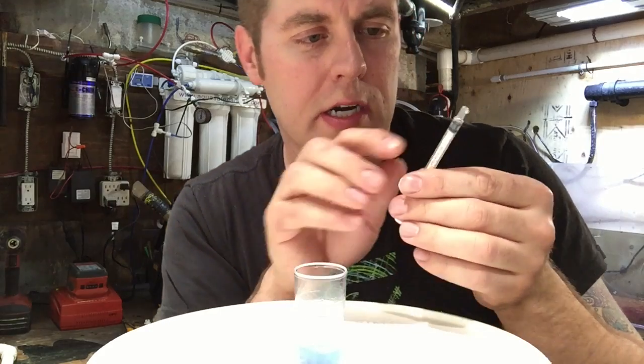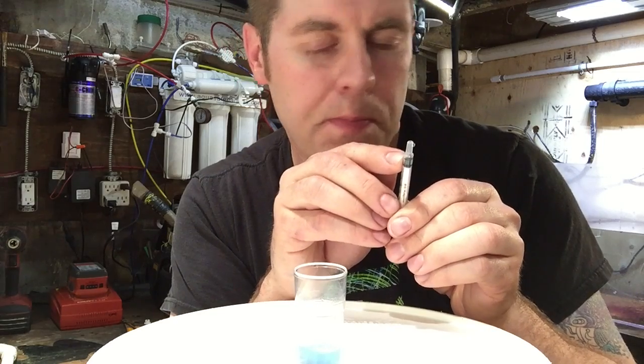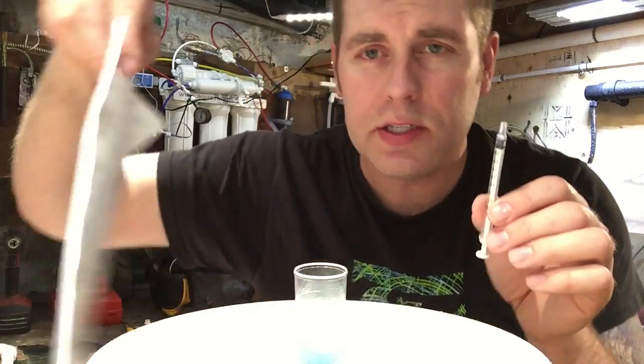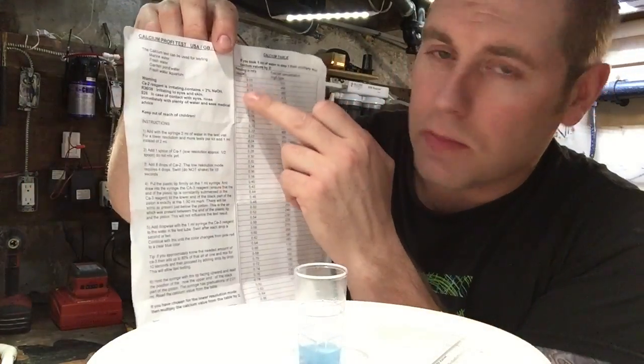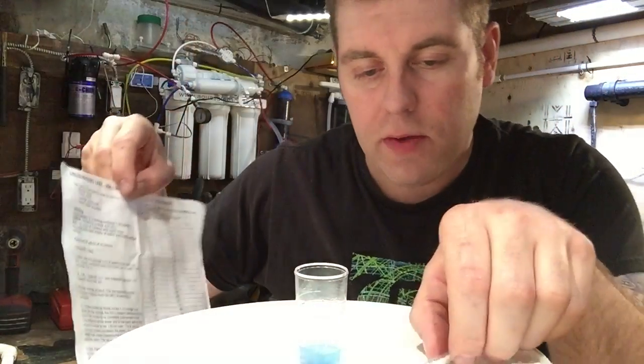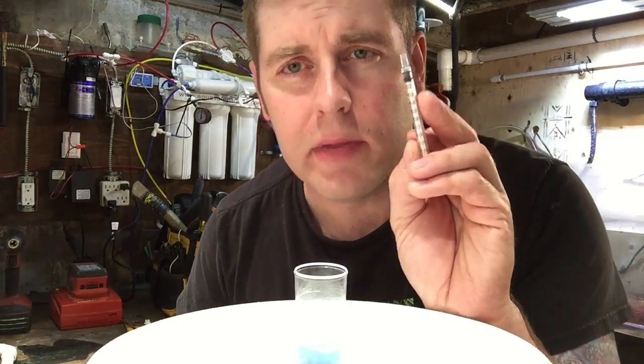So what we do now is look on our syringe and see what it's at. My calcium is pretty good — it's pretty high. It's at about 0.08 on my syringe. I'm gonna look at the chart that comes with the kit. The chart has all the syringe numbers on the left-hand side and parts per million on the right-hand side. At 0.08 on the syringe, that reads 460 ppm. So I'm about 10 parts per million higher than the ideal range, but that's not too bad — I'm pretty happy with that. At least I know my calcium level isn't low and my corals aren't starving for calcium.